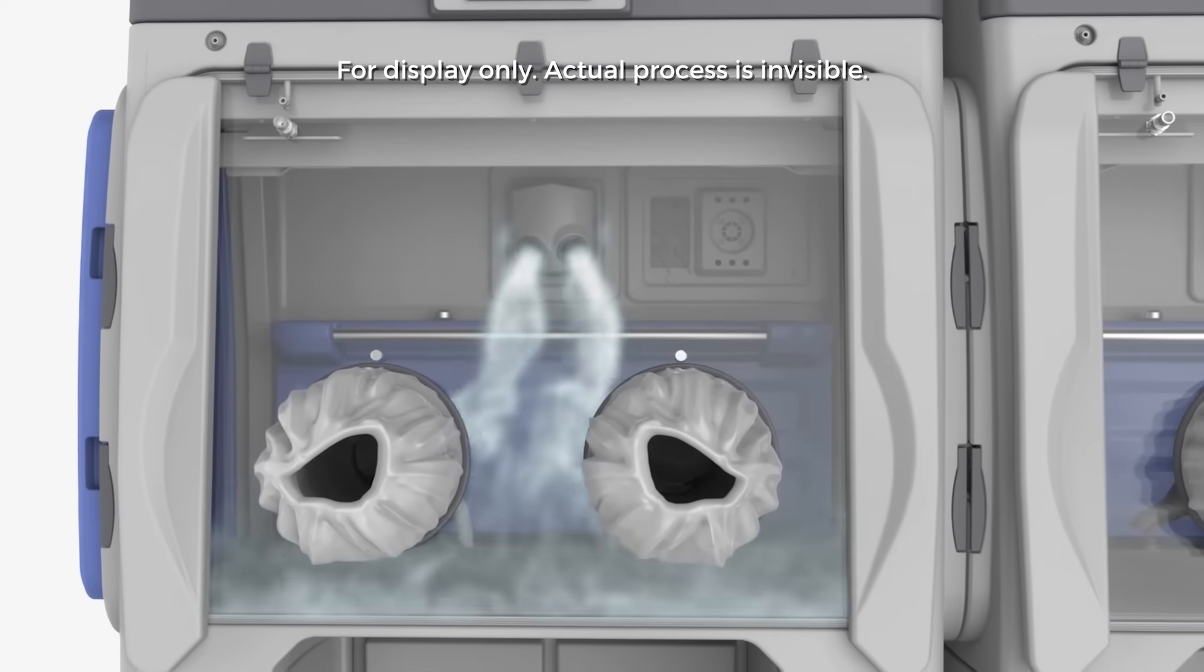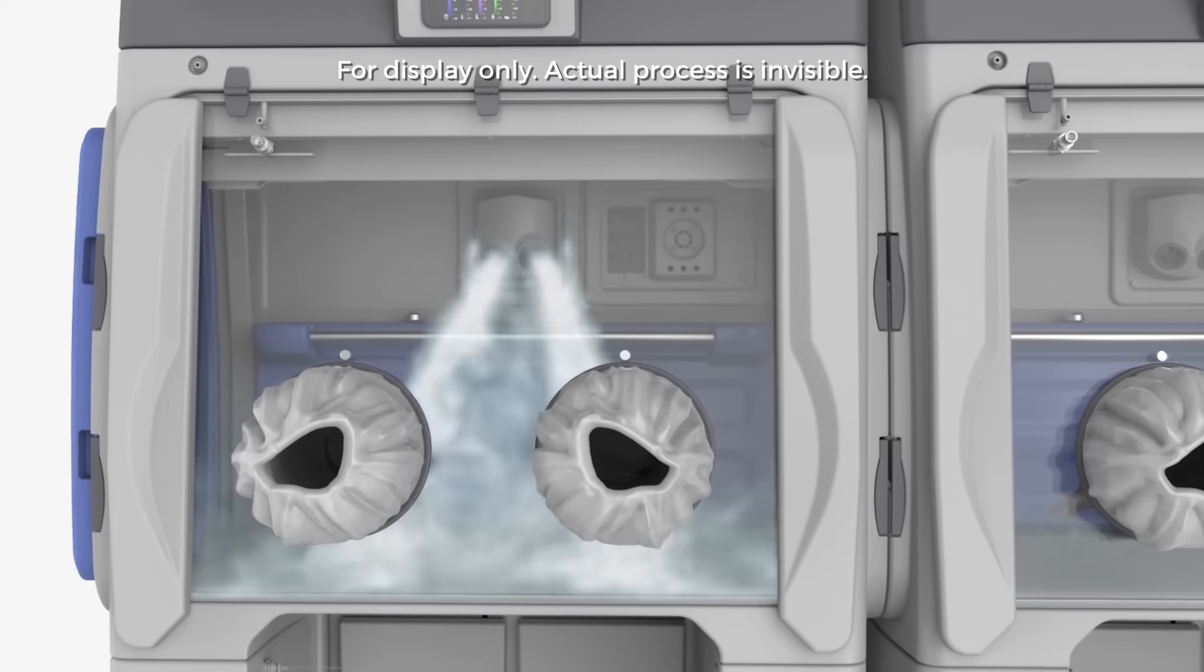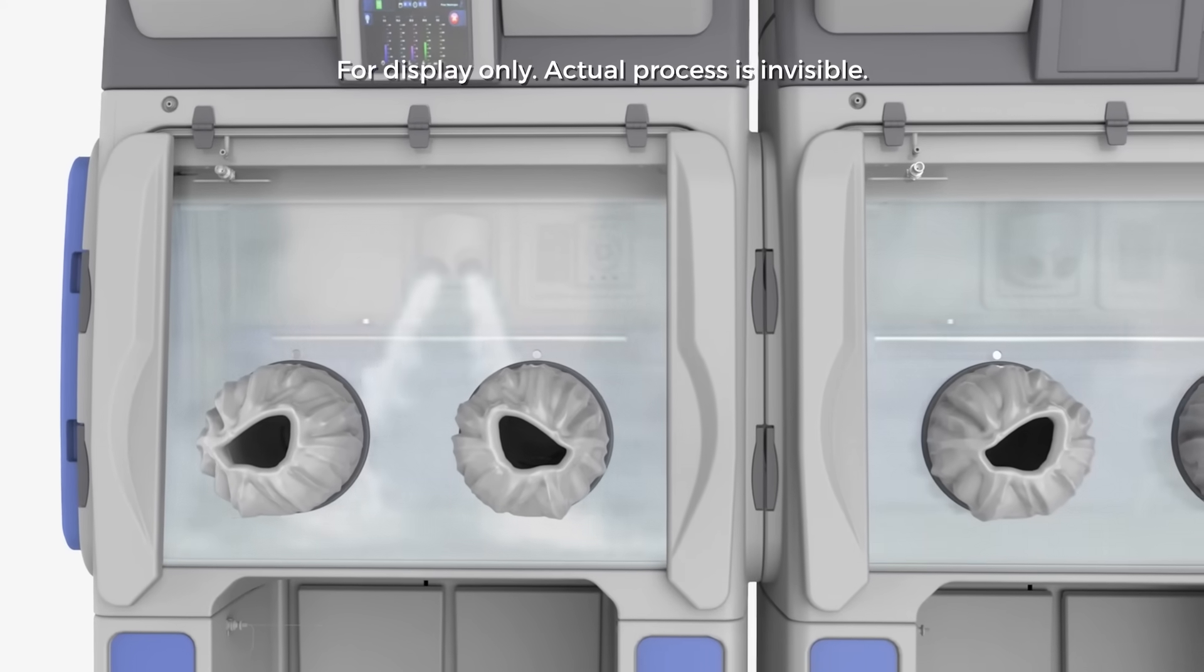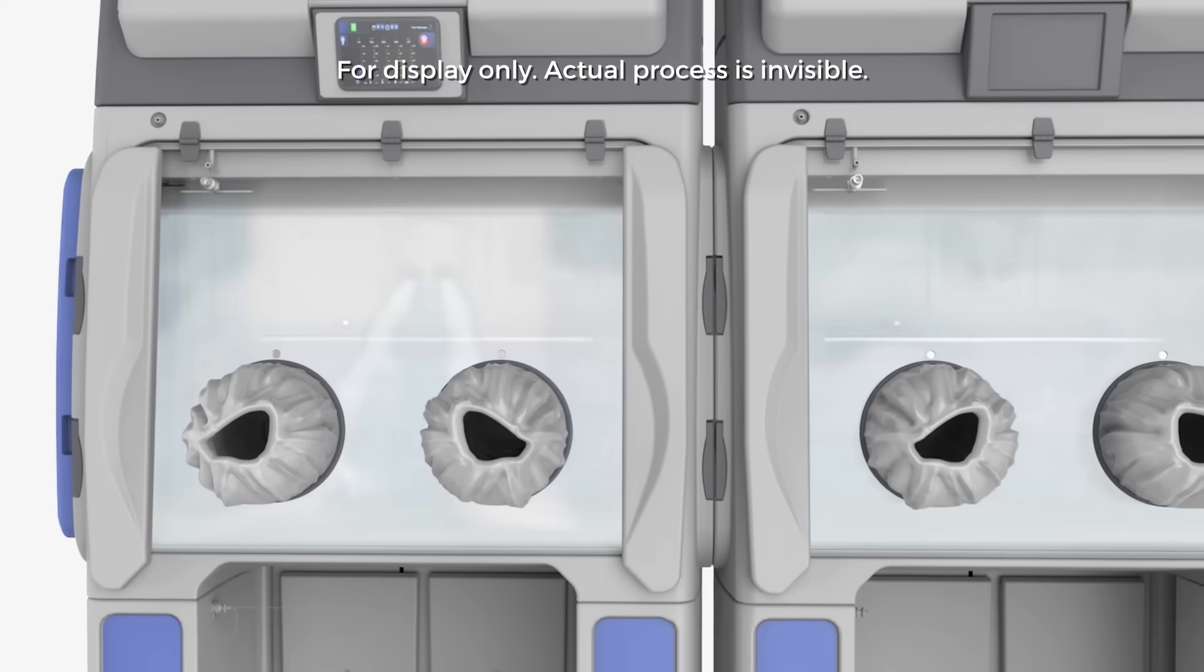The process is simple, effective and efficient thanks to BioQuell's hydrogen peroxide vapor technology and BioQuell hydrogen peroxide sterilant.